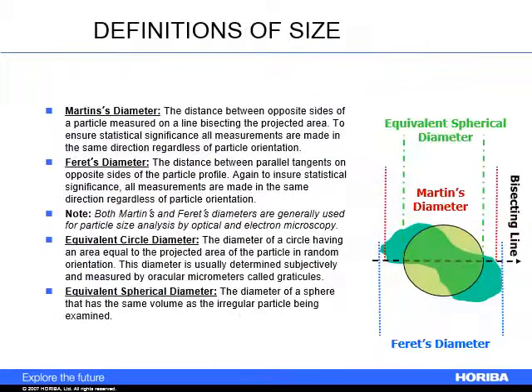There are also different ways of defining size. A lot of this has developed out of early fields of looking at microstructures in metallurgy. These are different ways of comparing the size of a grain, and being consistent when doing it on a picture that's already been taken optically or in electron microscopy. So you can look this slide over. I don't have to read it to you. You can read it in your own time.